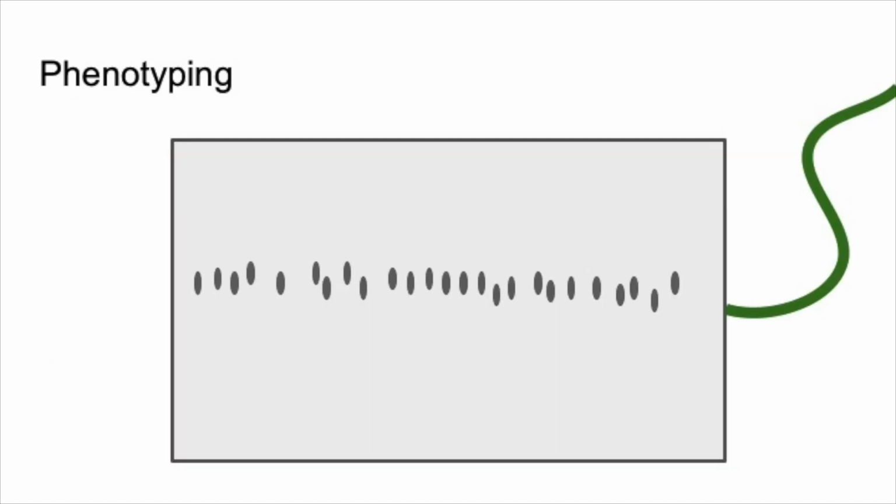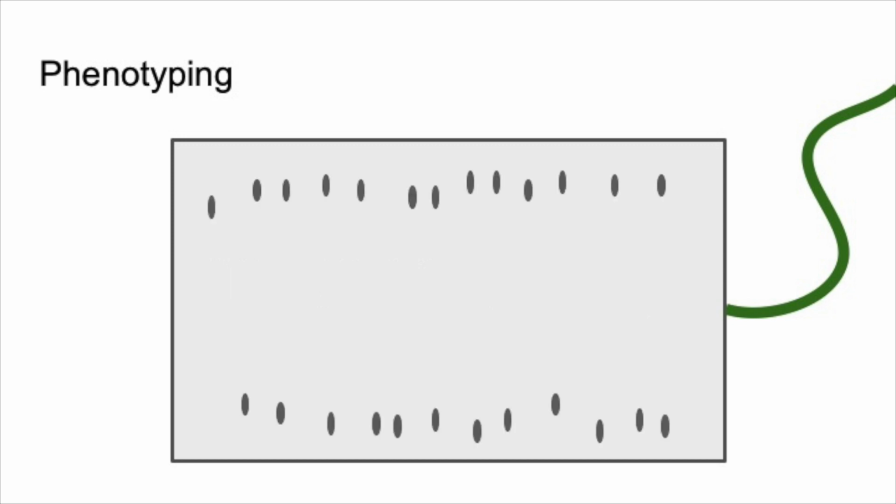Once you have the flies on the flow pad, I like to spread them out into a thin line, and then you can move from one end to the other, looking at each fly one at a time, phenotyping it, and then using your paintbrush to gently move it either up or down depending on what phenotype it is. Once you have all of your flies separated, you can easily brush flies off the edge of the pad into a vial, and then brush any flies that you don't need into the morgue.